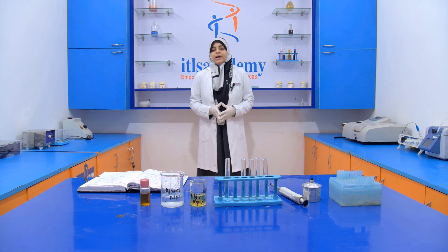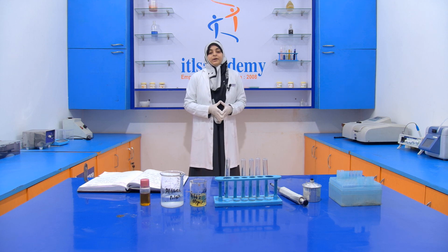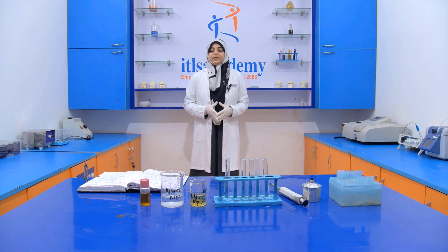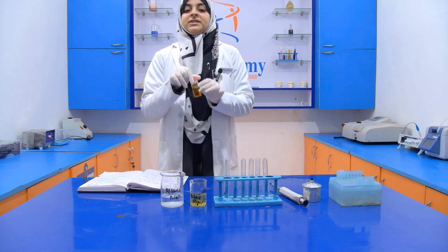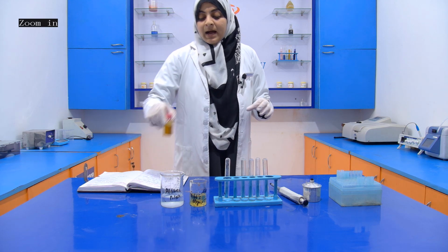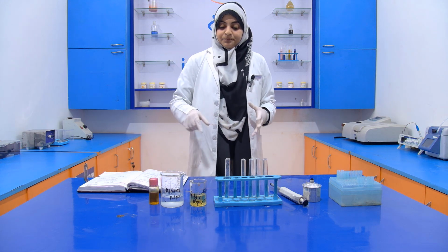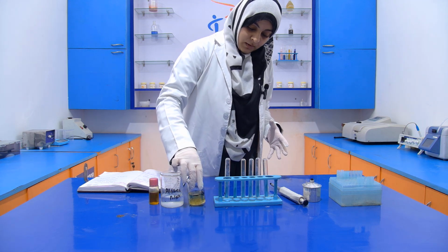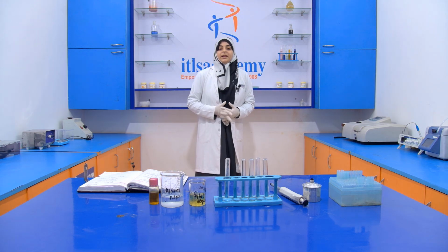Here mobile oil acts as an adulterant and our edible oil is our sample. So we take mustard oil as a sample and we detect whether any mobile oil is present in it or not.